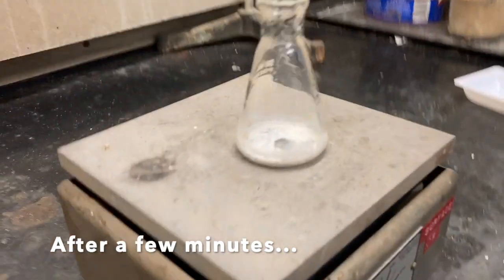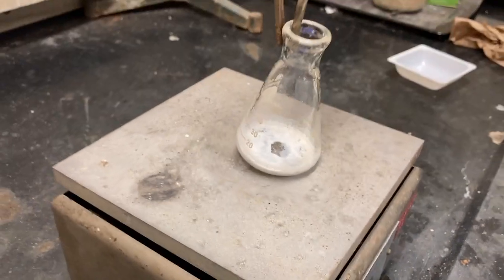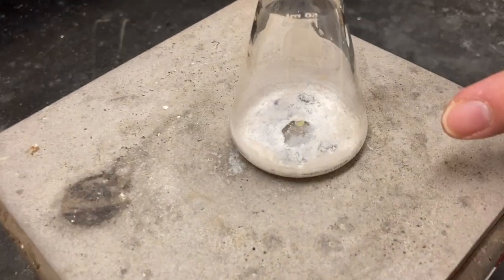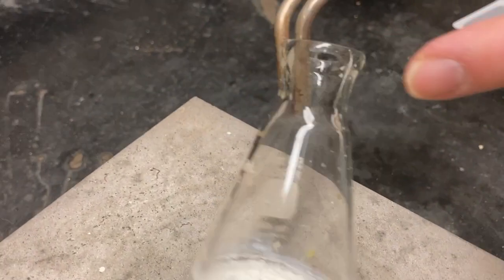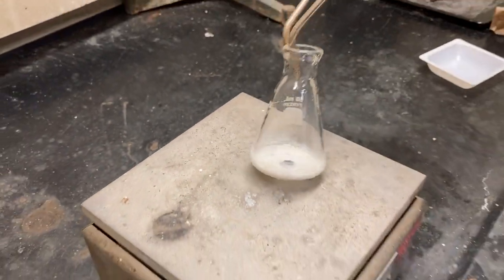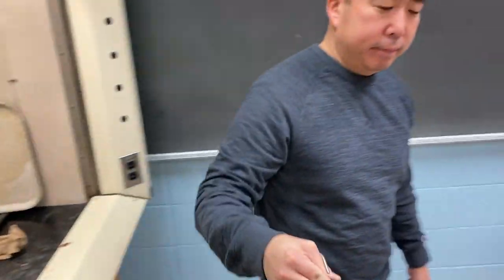Hey, Mr. Park, I think it's done. Yeah, see, all the moisture's gone, and you can tell it's gone because not only is it dry on the bottom, but the flask itself is dry by the top, because that's the last place where the moisture leaves. So if the moisture's gone, then we know it's done. All right, well, let's go away. After you.